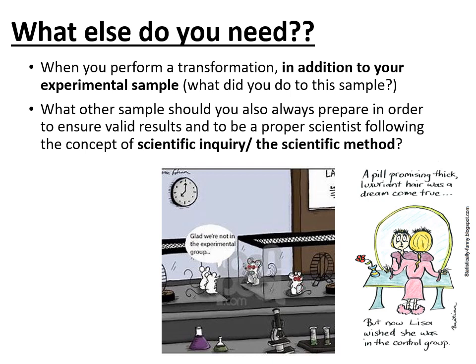Now, before we go through the expected results and the protocol, the last thing I want to mention in the background information is that whenever you do any experiment, you need to have a control group. You'll have a control group and you'll have control plates, which we'll talk about in the expected results.